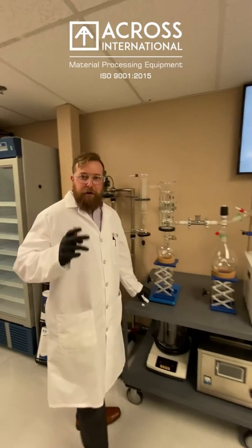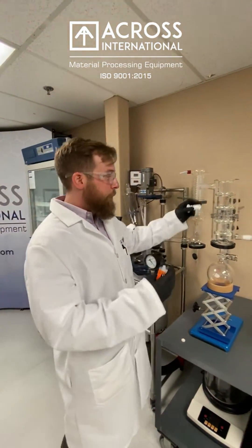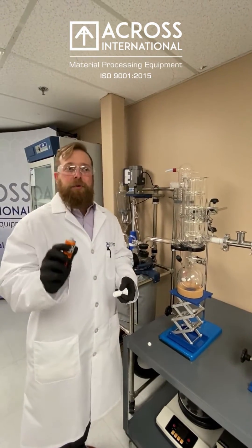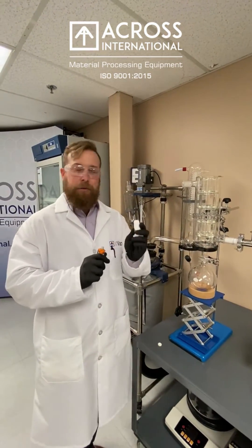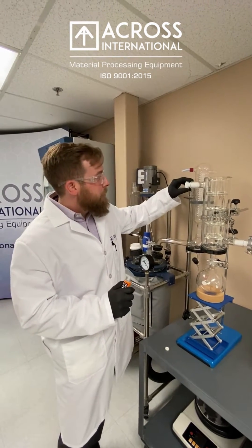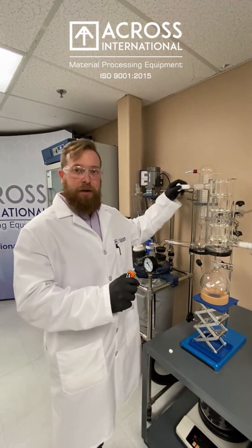Anytime you're using a glass ground joint on a short path or some sort of vacuum system, you more than likely are going to need to apply a small layer of vacuum grease to ensure a proper seal, as well as keeping the components from seizing up when you go ahead and separate them.